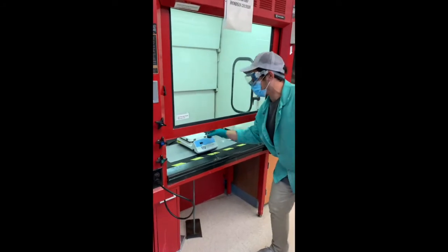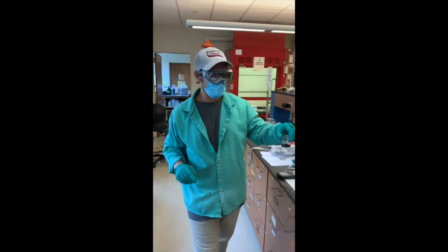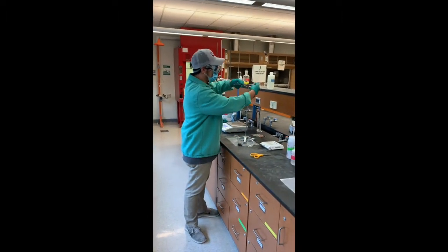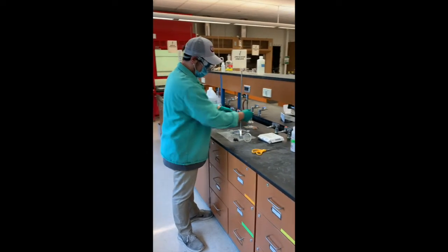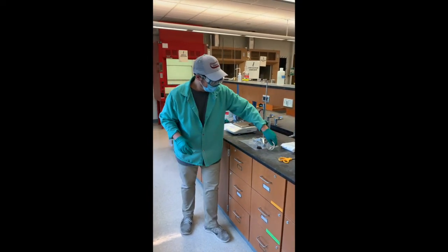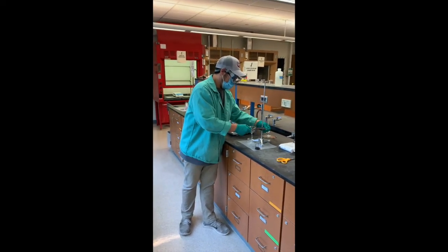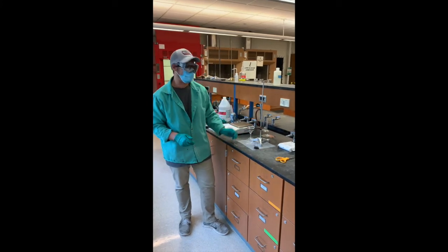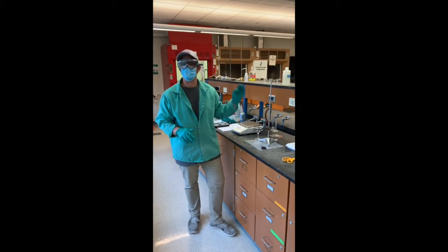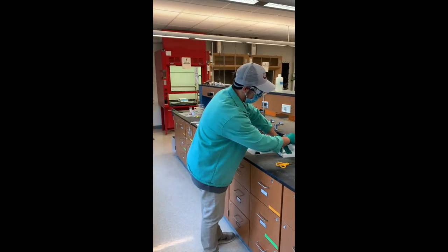So we are going to set up a gravity filtration where we're going to filter our reacted aluminum and potassium hydroxide. In order to do this, we're going to set up a ring on our stand here. You're going to have a clean 50 milliliter beaker. So this is setting up our gravity filtration. I have my ring stand, I have my funnel, and it doesn't matter if it's plastic or glass, we just need it. Placing the filtrate into our clean beaker.